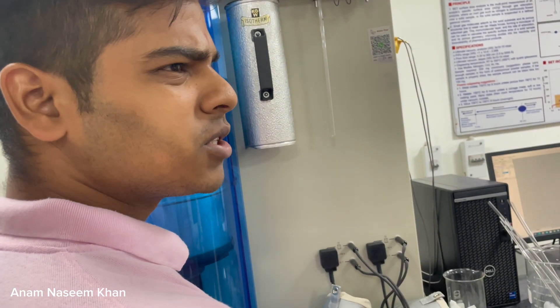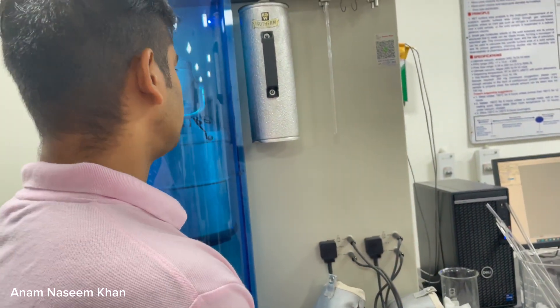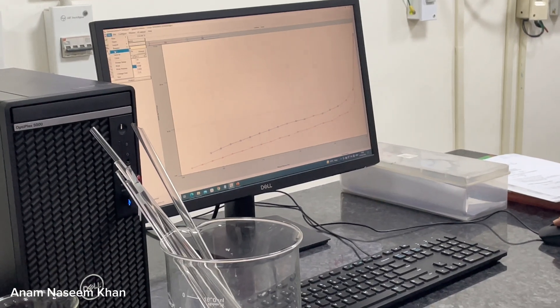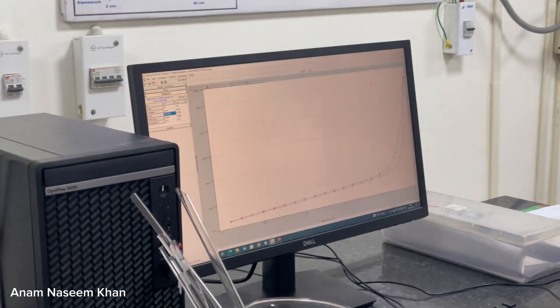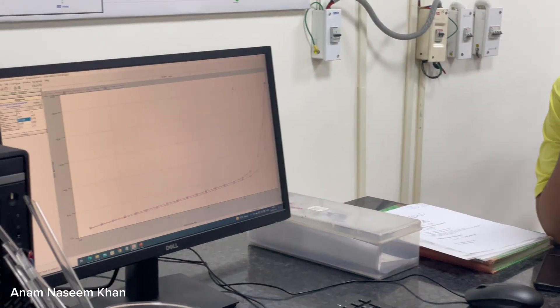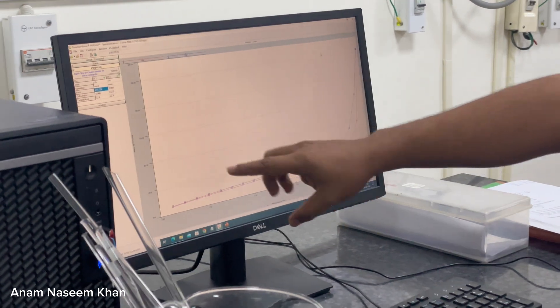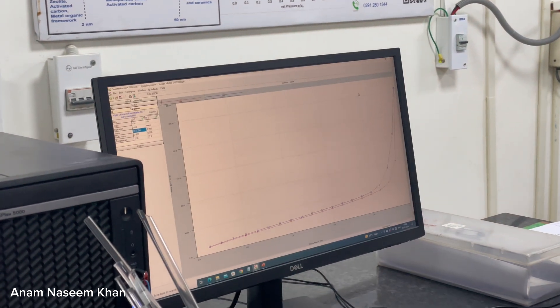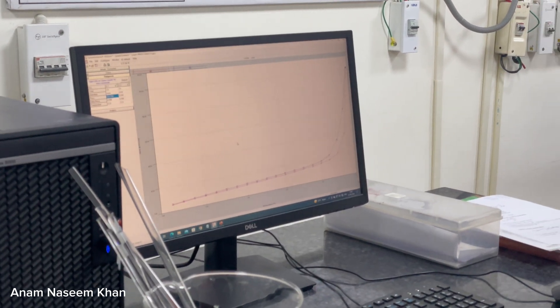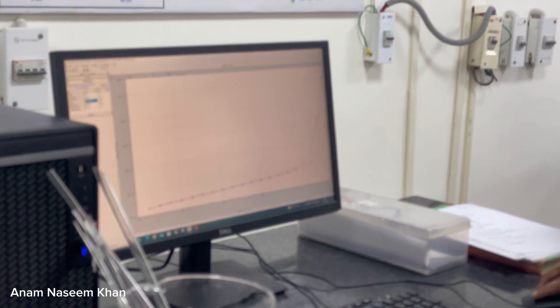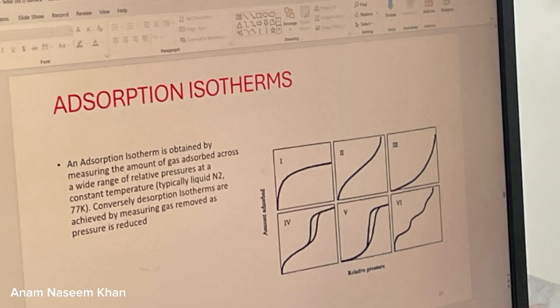After about five hours, data will come out from the process. This is the isotherm graph, where the x-axis is p/p₀ (relative pressure) and the y-axis is the total volume of adsorption. For calculating surface area using BET, the relevant p/p₀ ratio range is 0.05 to 0.35.